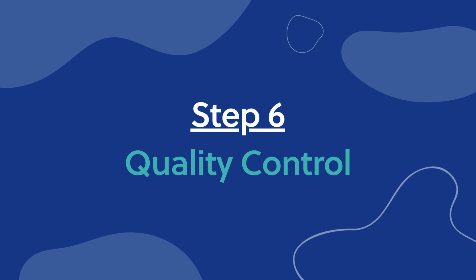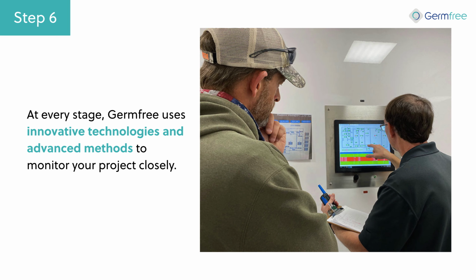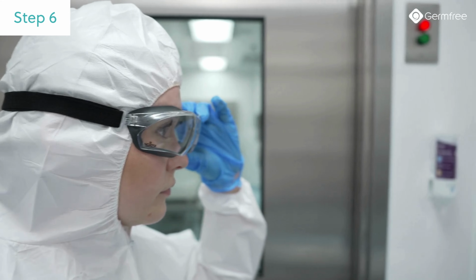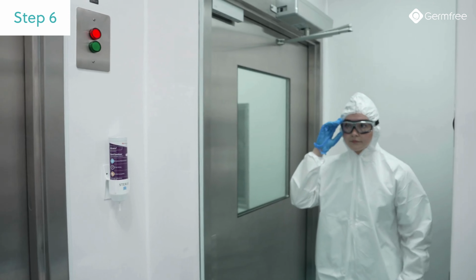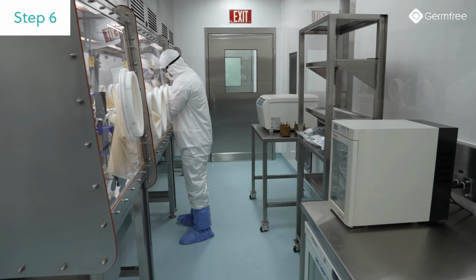At Germfree, quality isn't just a final check, it's built into every step. Our QC technicians use advanced methods and innovative technology to monitor every component and process throughout a project. We tailor our quality control solutions to your specific facility needs, ensuring precision, safety, and regulatory compliance from the very first drawing to the completed installation. The result is confidence, a facility that not only meets industry standards, but is designed to perform reliably for years to come.